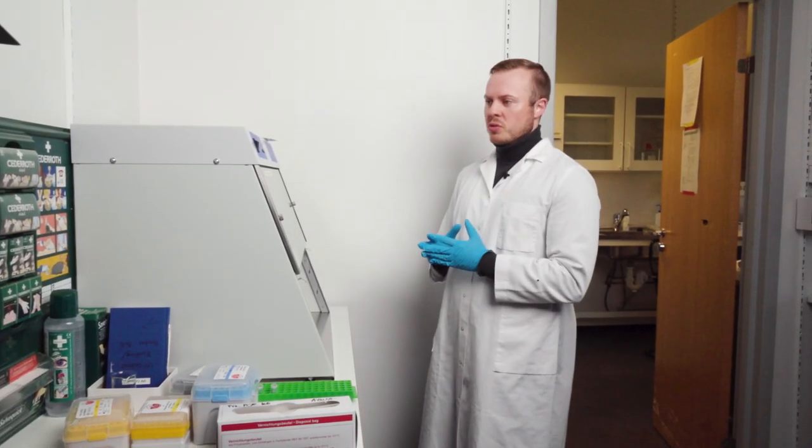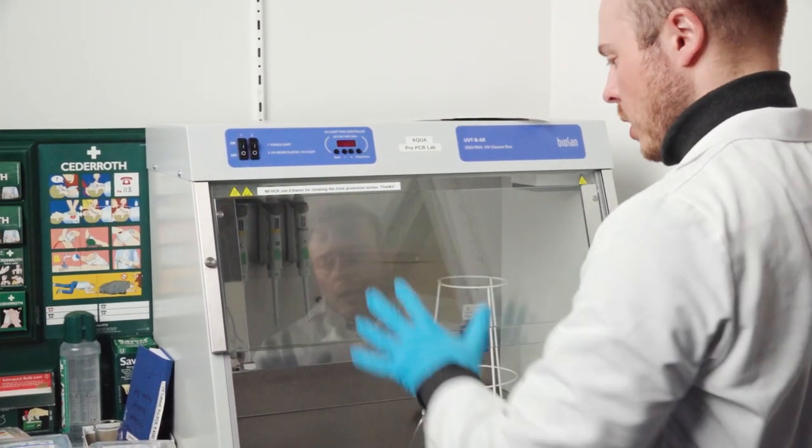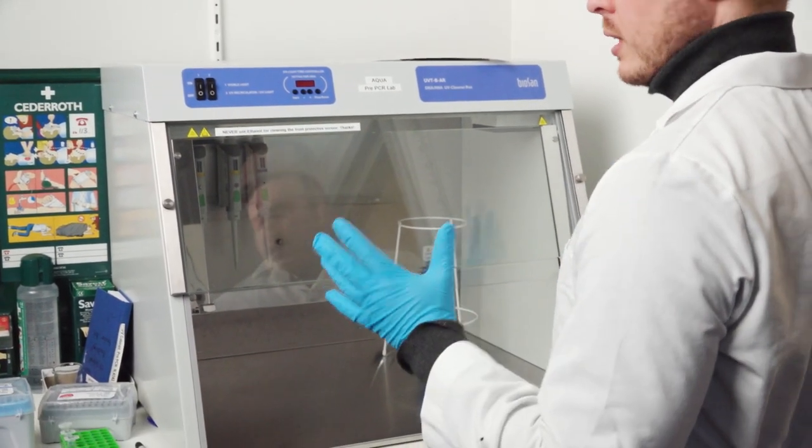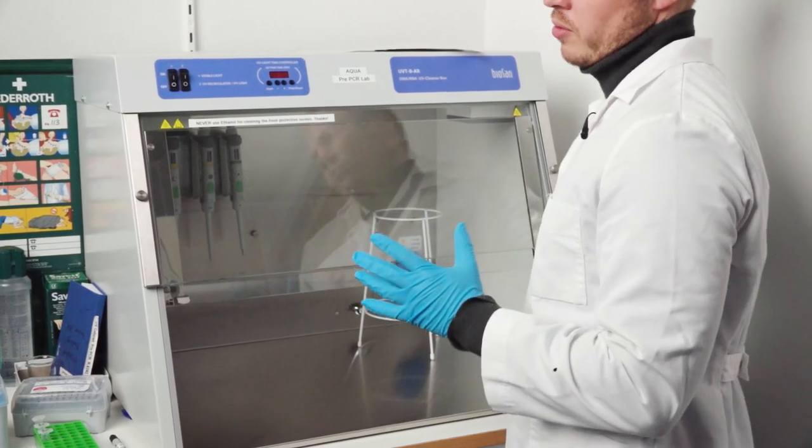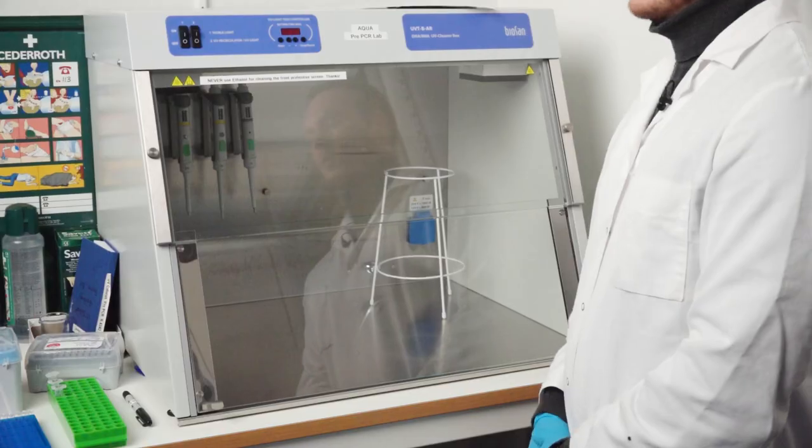So when you approach the UV cabinet all of the switches should be off, no lights, that indicates that it's totally off. So the first thing we do is just to check that the door is locked down because it should always be locked down when it's off.